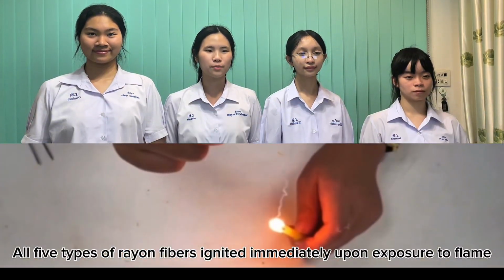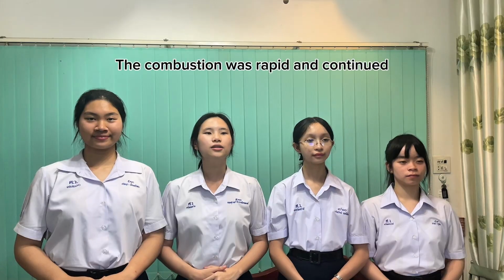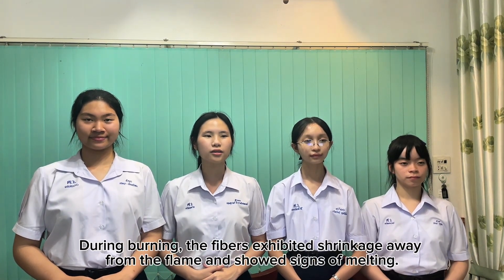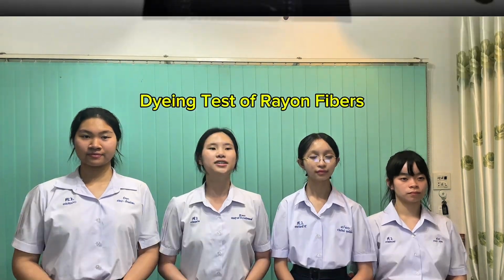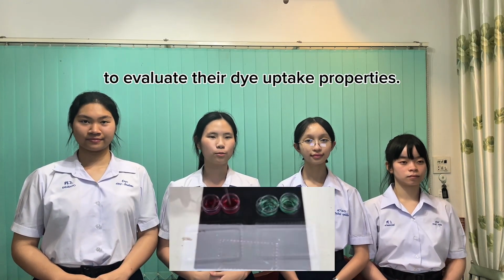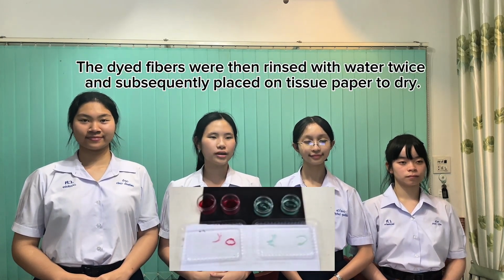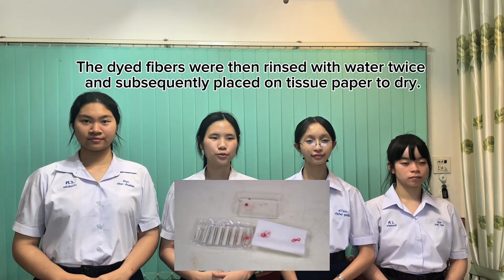All 5 types of rayon fiber ignited immediately upon exposure to flame, producing an orange flame. The combustion was rapid and continued until the fibers were completely consumed. During burning, the fibers exhibited shrinkage away from the flame and showed signs of melting. Second, dyeing test of rayon fiber. The prepared rayon fibers were dyed to evaluate their dye-absorbing properties. After dyeing, the fibers were placed on a plastic dish and left to dye. The dyed fibers were then rinsed with water twice and subsequently placed on tissue paper to dry.